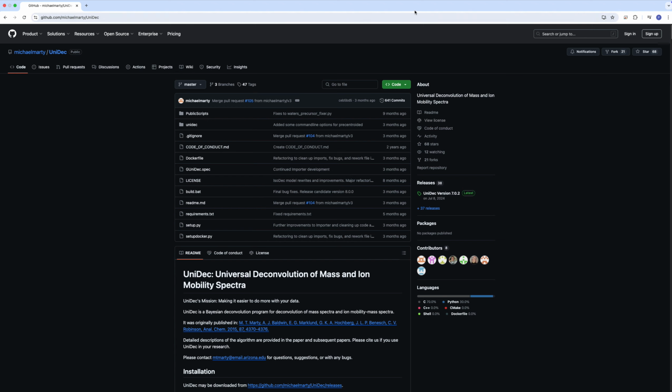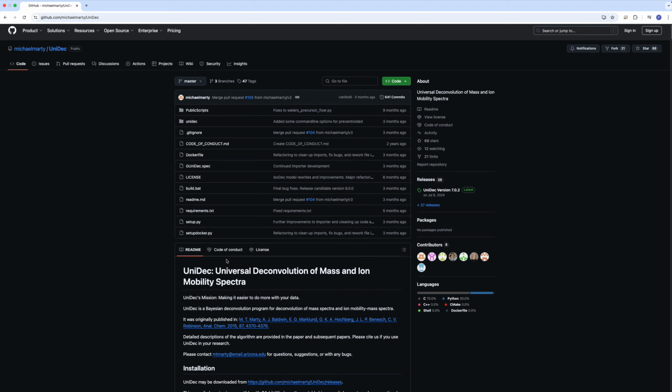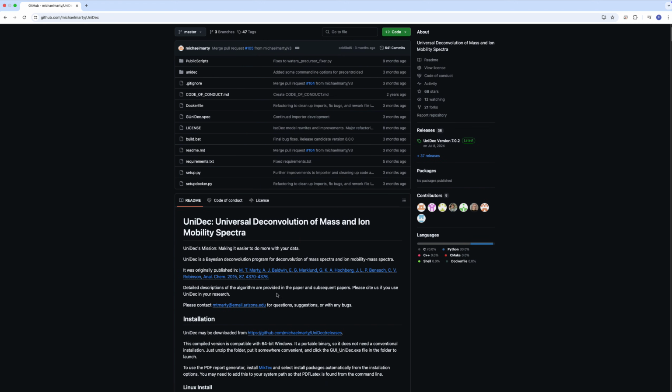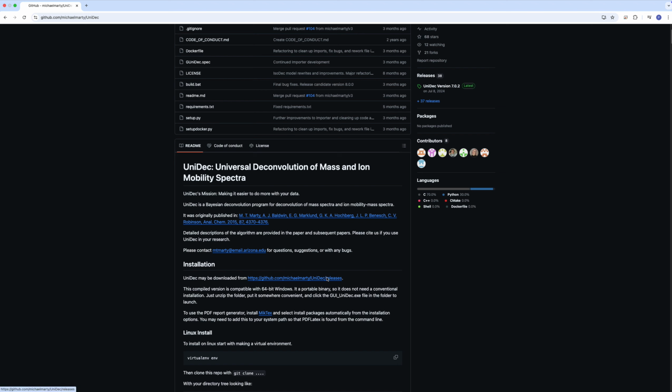Today I'm going to show you how to install UniDec on Mac. So UniDec, probably most of you are familiar with this. That's why you're looking for a solution on how to install it on macOS. And for the ones who don't know what UniDec is used for, it's a program used to deconvolute raw data for mass spectrum. It gives you the spectrum for mass spectrum, and then you can deconvolute it.